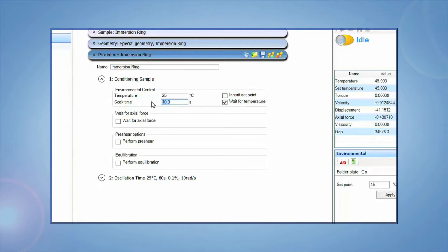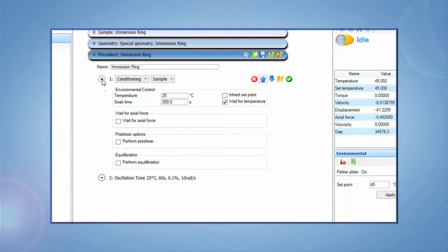Let the temperature stabilize with a minimum five-minute conditioning time, and then run your test. In this technique we discussed why and how to use the immersion ring for a DHR. You are now ready to use your sample under an immersion fluid. Please stay tuned for more informative tech tips, and thank you for your interest.